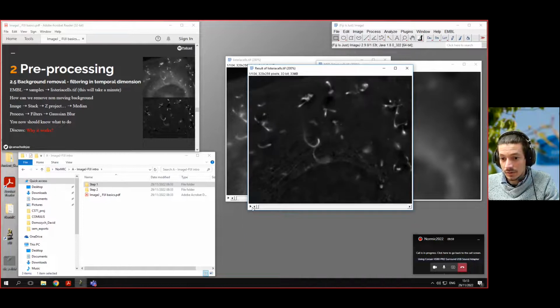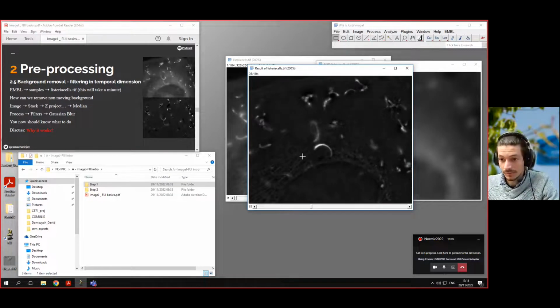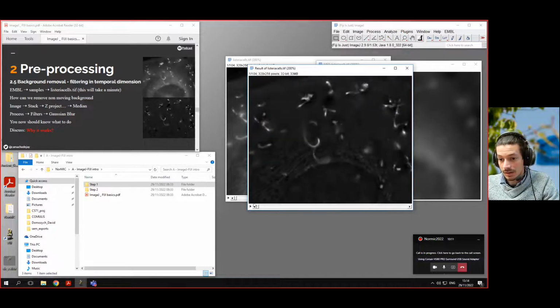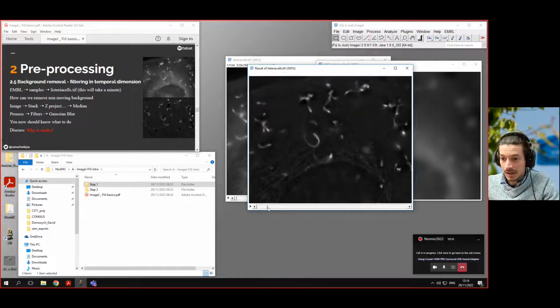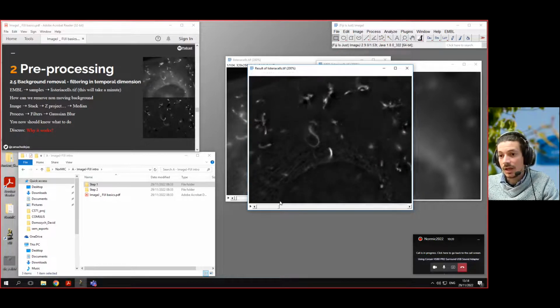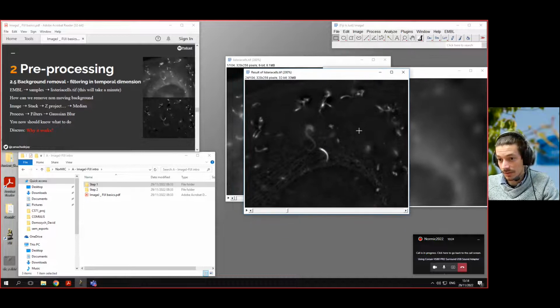All right. And then you will see now if I play this movie that the features that we're interested in are much more enhanced against the background. Now, another feature that you will see if I play this movie very quickly is that the background subtraction worked much better at the end than at the beginning. And this is probably because we also have a background that is bleaching, right, that we could correct for later on with a little bit more advanced methods, but this gives you an idea.